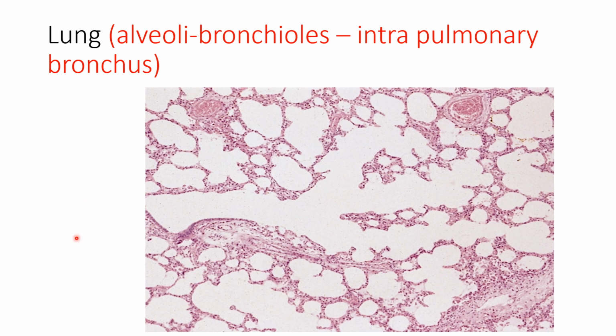Good luck, dear students. First, I would like to tell you something important about the exam of the microscopic slides. Each one of you will be examined on 9 microscopic slides. Each one of you will stand in front of a microscope. Under the microscope, there is a large paper containing a number and an arrow. The number is the number of the microscope you're standing in front of.